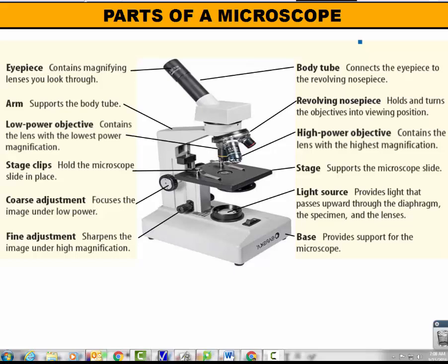Hi there everybody, welcome to our vodcast on the parts of the microscope and how to use a microscope. In this vodcast we'll talk about the different parts that make up the microscope and how to use them to focus in on an object. So let's get started.